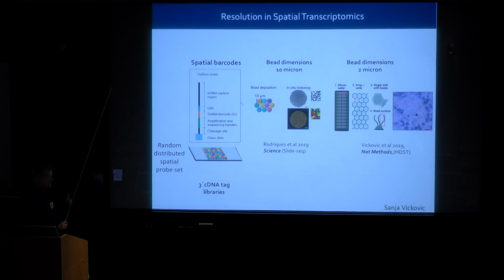So what are the caveats of this? The beads, you mix each bead with a probe, and then you distribute the beads in a random fashion onto the glass surface. So you don't really know which bead contains which DNA sequence. So you have to decode this before you do an experiment. And this is true for Slide-seq. You do in situ sequencing of the beads.